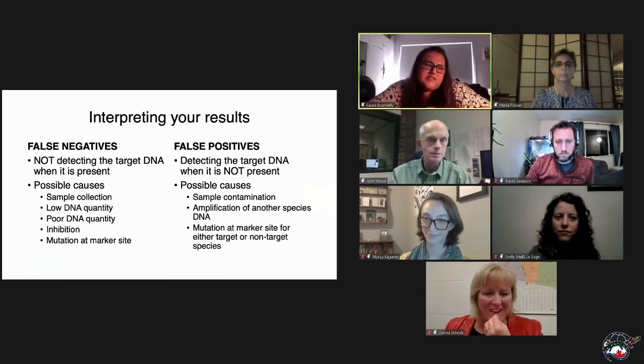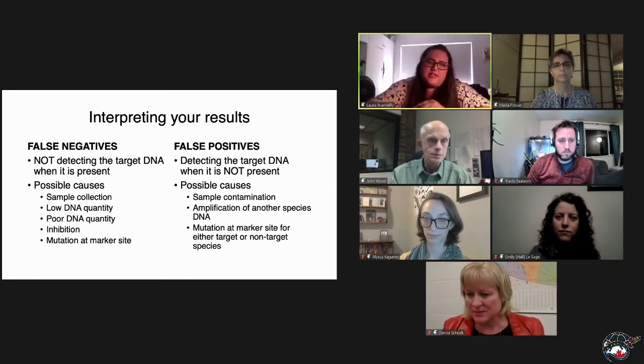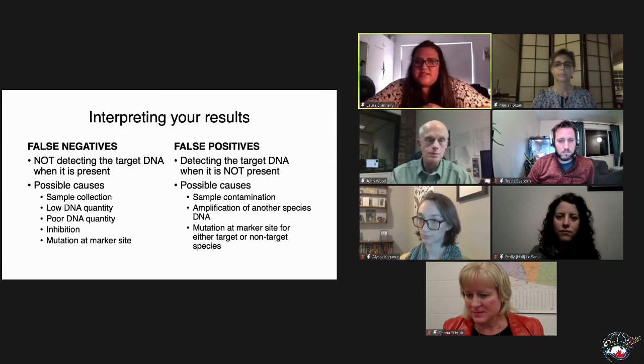So this is very important to just understand what your false positives and false negatives are. This is true for any DNA work. You're going to run into these issues if you're working in this space.